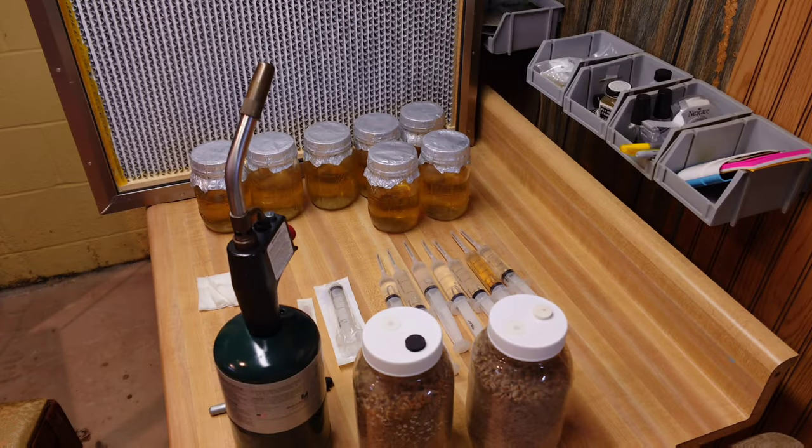Hey guys, welcome back to the Mushroom Dungeon. We are set up in front of a laminar flow hood — technically a tabletop HEPA filtration clean air device — and we are ready to refresh some liquid culture jars. I've been getting a lot of questions on how long your LC jars will last under refrigeration, when you should refresh them, and how to do that, so we're going to cover that today. I'll show you two different techniques.